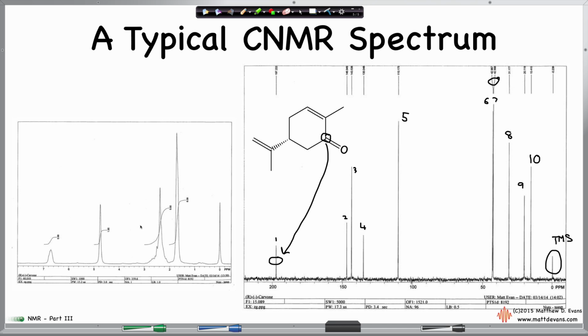Now compare that to the hydrogen NMR. The hydrogen NMR is a complete mess. You expect a little bit of splitting patterns, clean splitting patterns, forget it. It doesn't happen. This thing's a mess. Everything's a mishmash of stuff. The integrations are accurate, so you can see that this is 1, 3, 8, and then 14 total hydrogens. That's fine, but you just don't get a whole lot of information. In fact, this one represents several different types of hydrogens right there that are all just mashed together. But the carbon, very clean, very easy to interpret.